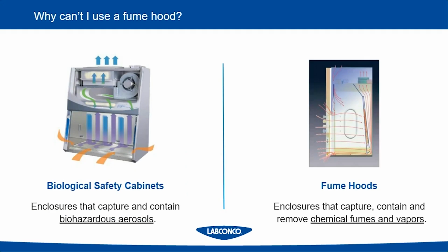One of the first questions we often get is, can I use a fume hood, or can I use a biosafety cabinet, or which one do I need? Before we get too far into the talk, I want to outline a little bit about the differences between a traditional laboratory fume hood and the biosafety cabinets that we're going to be talking about today. When somebody asks me if they can use a fume hood for their work, I always like to break it down to a very simple question.